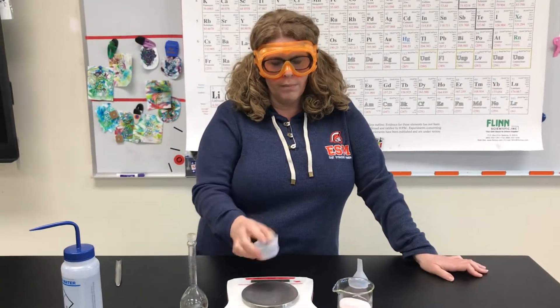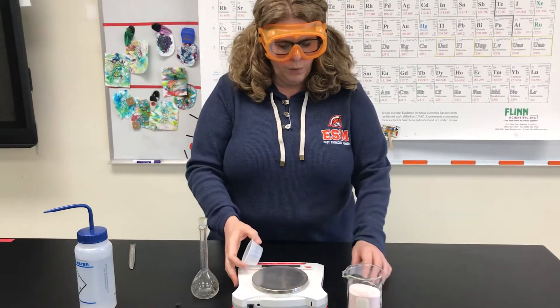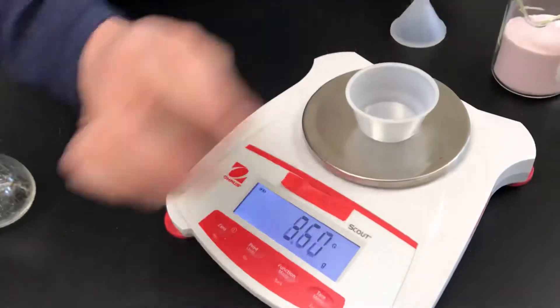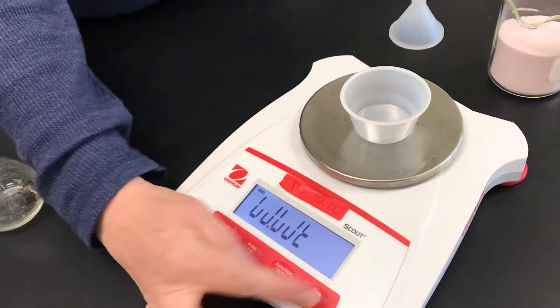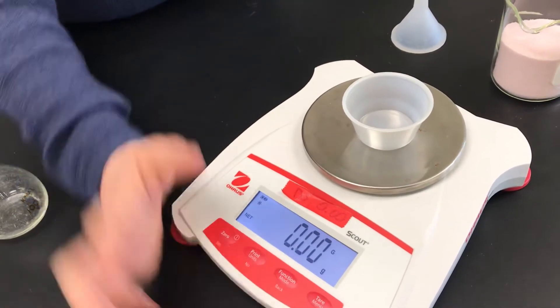So the first thing I'm going to do is weigh out the 8 grams that I calculated of the Kool-Aid that I need. So I'm going to put it on my balance, tare it, and now I'm going to weigh out 8 grams of Kool-Aid using my spatula.